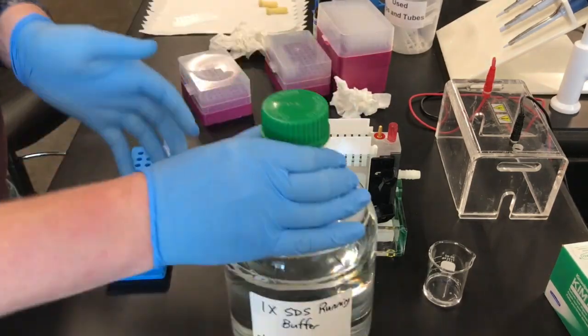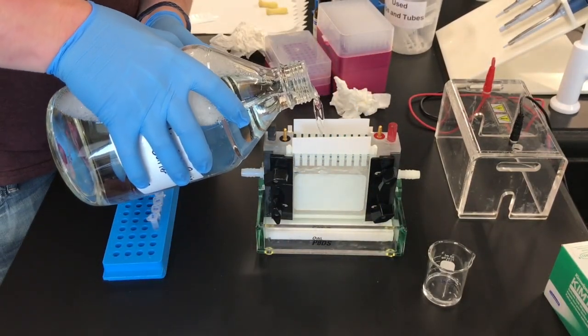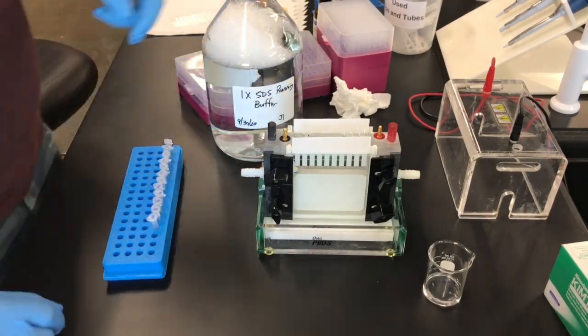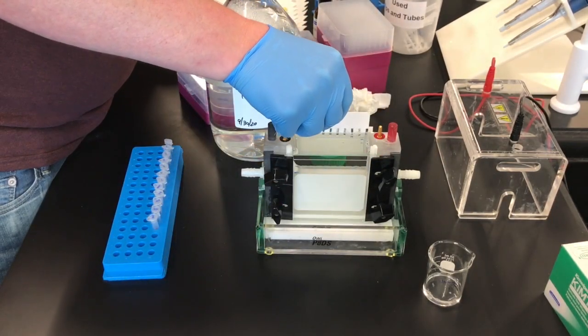To get ready to run the gel, take some 1X buffer and fill the middle chamber all the way up to the top. Then, you can take out the combs so that the buffer can go down into the wells.